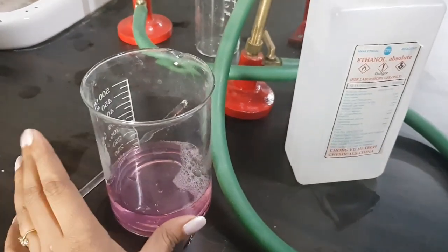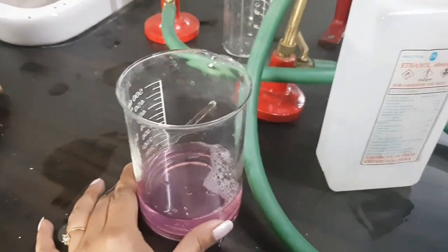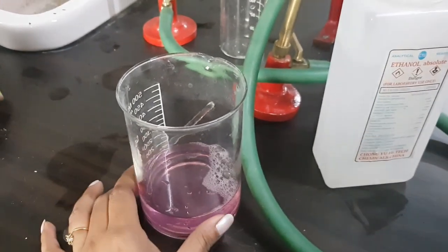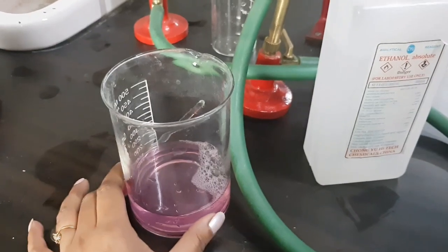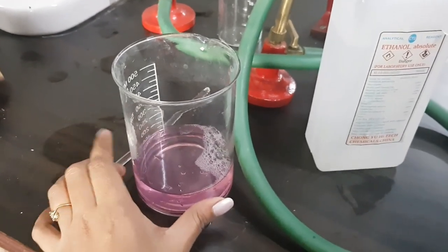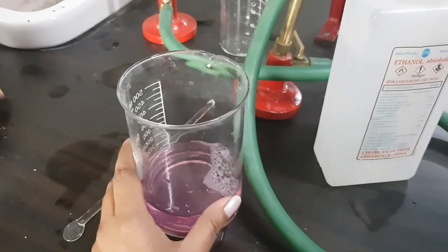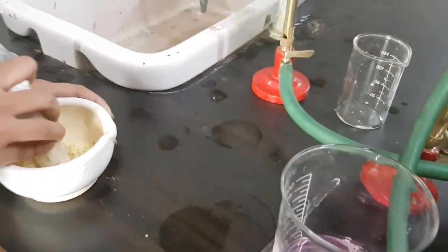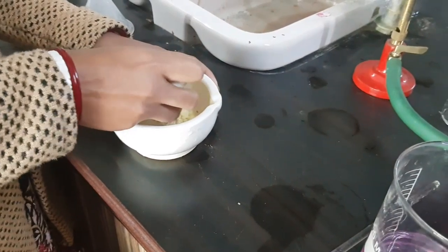In this beaker there is a little bit of salt, little bit of distilled water — or any tap water you can use — and a little bit of detergent. These three things are mixed together in this beaker. Along with that, chilled alcohol, that is ethanol, and one banana that we have to smash.